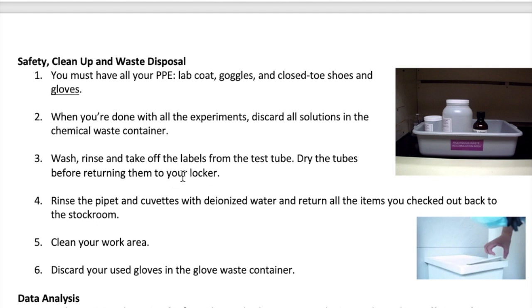Dry them well before putting them back inside the locker. If you leave any water in the test tubes, it can drip and damage the wood. Rinse the pipettes and cuvettes well with water and dry them before returning them back to the stockroom. Wipe your bench and sink area clean with paper towel. Discard your gloves into the dirty glove compartment, which looks like this and is located near the entrance to the lab.